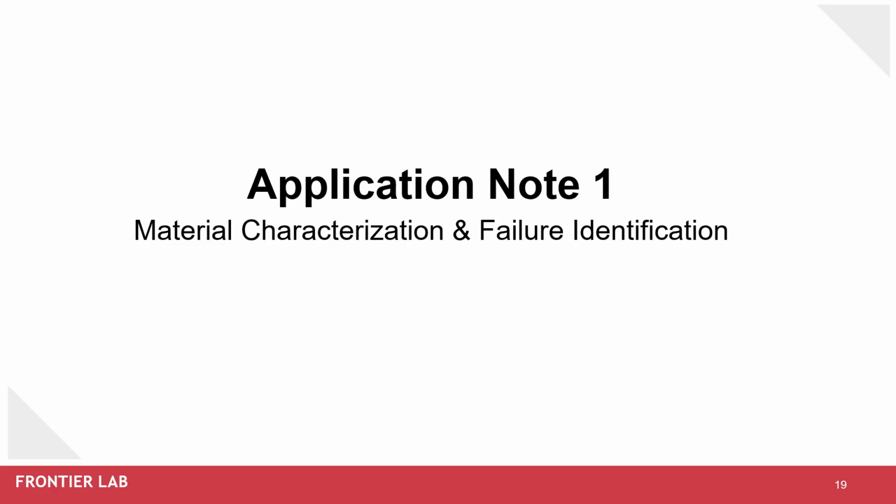So now let me go into an application note, as I promised, for material characterization and some failure analysis. The first one is going to be directly on performing reverse engineering or deformulation analysis and performing failure analysis at the same time.